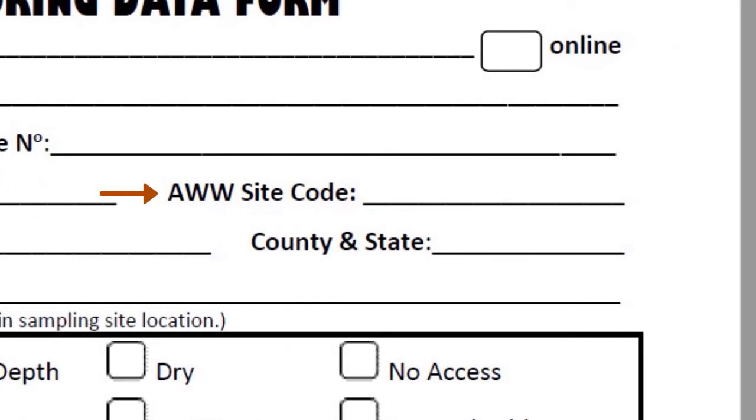Alabama Waterwatch Site Code. Record the AWW site code assigned to this location by the AWW staff. You likely won't have one of these if this is your first time sampling at a new site. If you have multiple sites, double check that you are recording the correct AWW site code. Please contact the AWW staff if you change monitoring location and include a complete description of the new location with a map or georeference if possible.